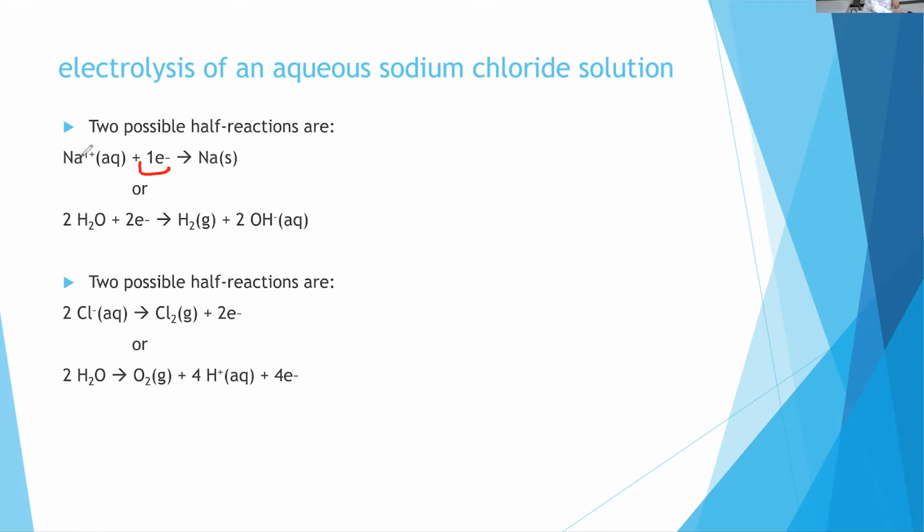If sodium is reduced, we should see sodium being deposited on the electrode. I would see a gray color of the sodium. But it's kind of impossible, because if I have water in the aqueous solution and sodium is produced, it's going to explode. So before anything, we would see an explosion if sodium is coming, so you would see a reaction taking place.